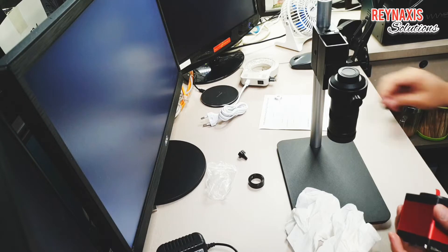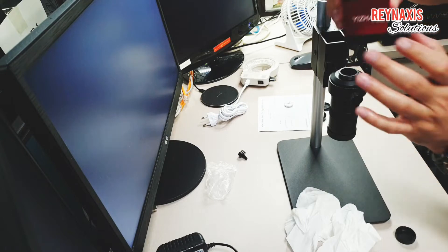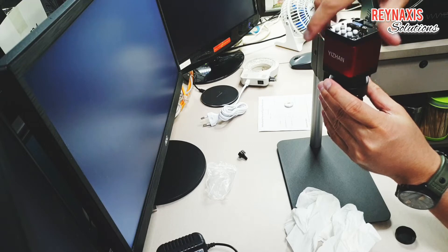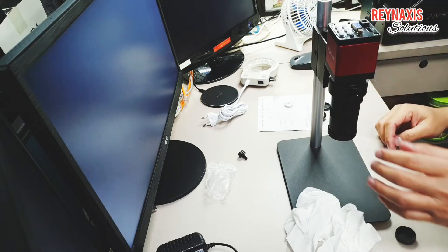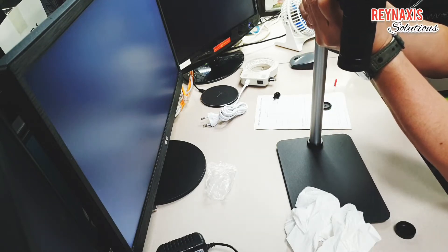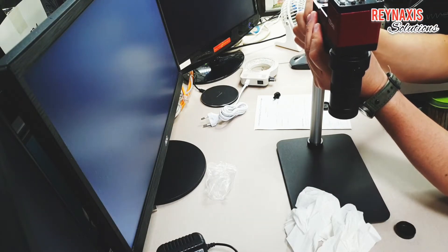Now we're going to unscrew the cap protecting the lens of the digital microscope and attach it on top of the lens. I'm lightly trying to attach the camera slowly — I don't want to tighten it really hard. I made a mistake here: I should have put the ring first and the holder next. The ring will add protection to the microscope holder and prevent it from sliding down.